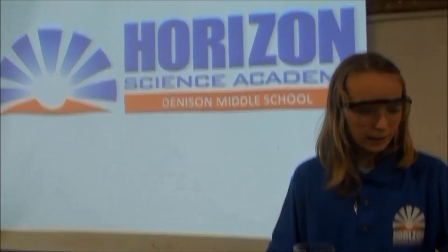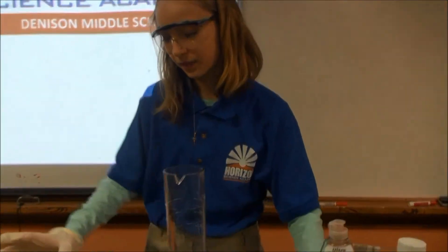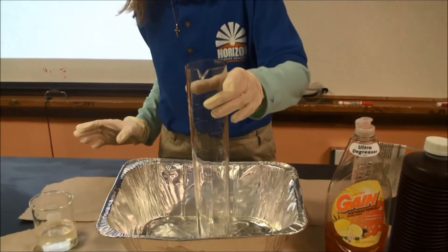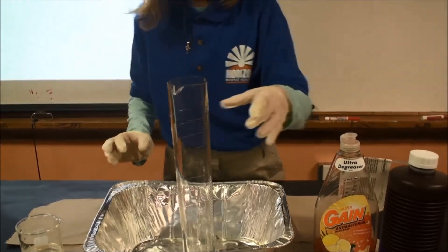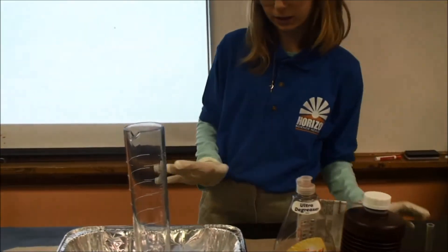First we got hydrogen peroxide, dishwashing liquid, food coloring, potassium iodide, a graduated cylinder up to 500, and this one is the graduated cylinder up to 10 milliliters.